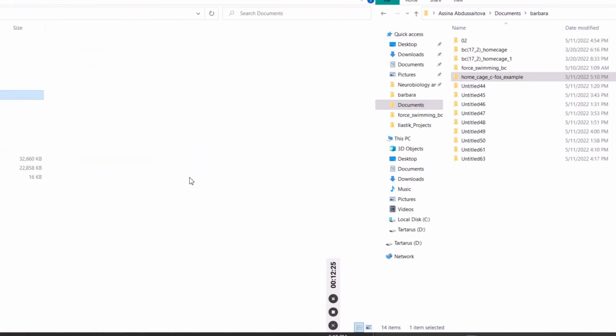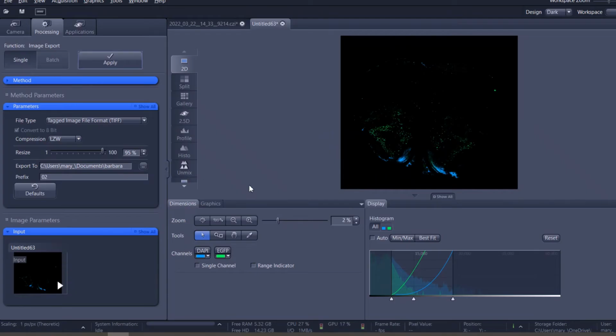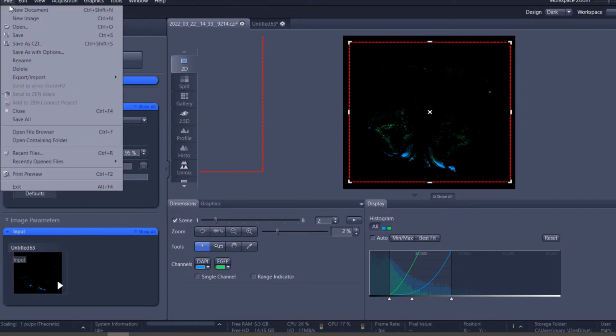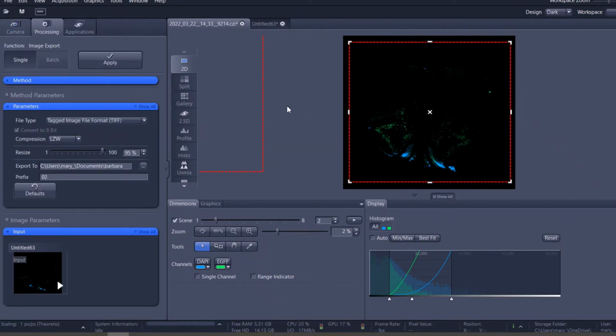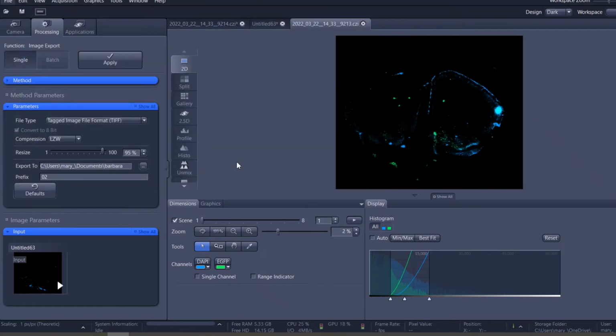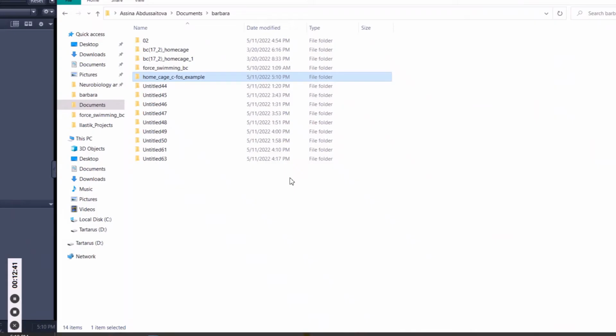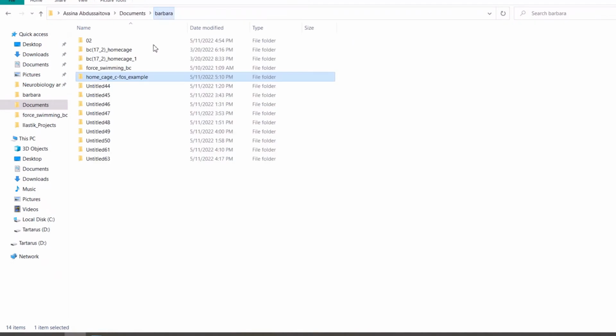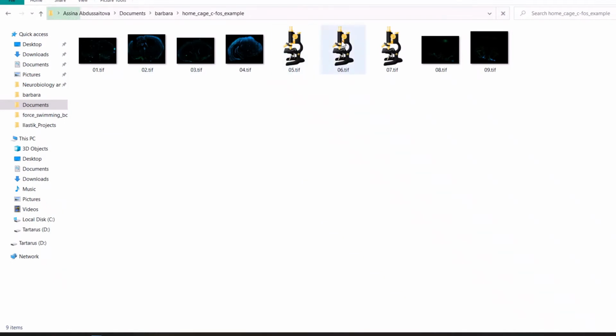I also want to stick with the enumeration of each slice, so I know which number has which slice. I'm just copying and pasting each one into the folder. I put it on pause and basically gathered them all in one folder.